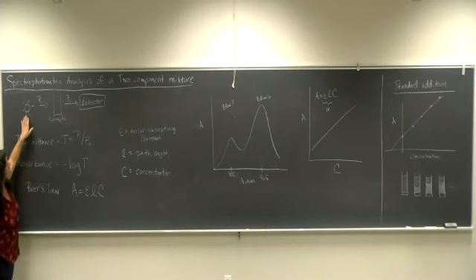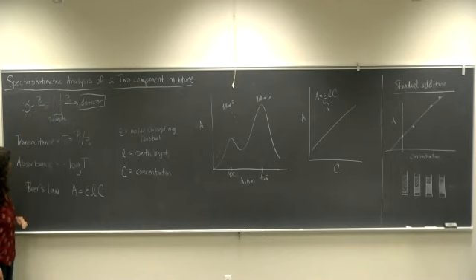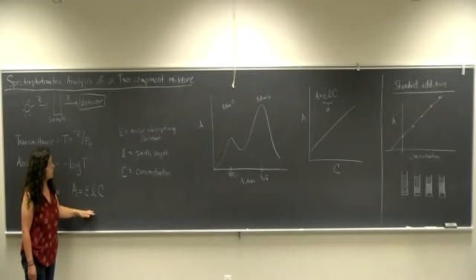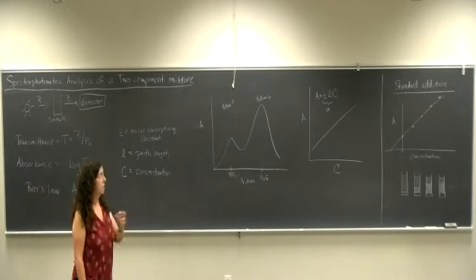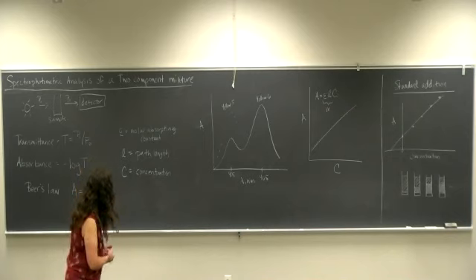And so the detector measures the amount of light that is transmitted through the sample, and that's converted to absorbance, and then we can use Beer's law to calculate the concentration of a solution. And so in Project 3, you did this with an unknown concentration of protein. In this project, we're going to make it a little more complicated because now we're giving you a mixture that has two different things in it, and we want you to calculate the concentration of both of those.